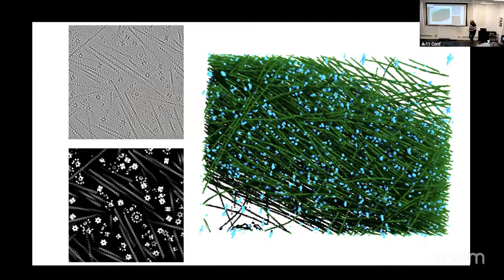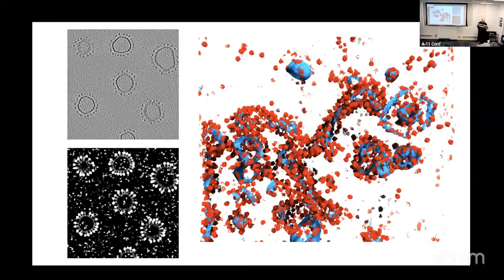And there it is in 3D. You can see, obviously, it gets some noise in the background as well. And just to show that it works on a variety of things, this is a segmentation of actin bundled by this protein called CaM kinase 2. So that's what these little blue specks are. Makes this huge bundle. And all I did was put actin and CaM kinase 2 into CTS, and it spit out this synthetic tomogram and a ground truth, trained the network, and it was able to pick out all of that. And if you look closely, it even gets the helical twist in the actin filaments if you look at single actin filaments. I mean, it's certainly better than I can do by hand, is all I'm trying to point out.